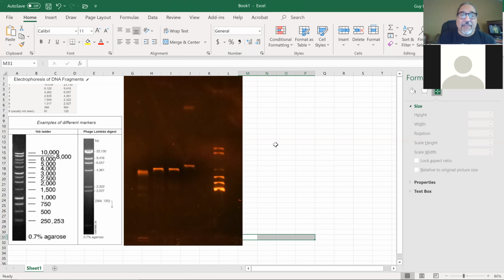The reason is that the convention of where to put the well in a picture depends on your background and training. People who are trained in chemistry and biochemistry labs generally look in one direction. People who are trained in biology labs look in the other direction. It's just a question of where everybody was trained and how they like to do things. So all you have to do is remember which direction.